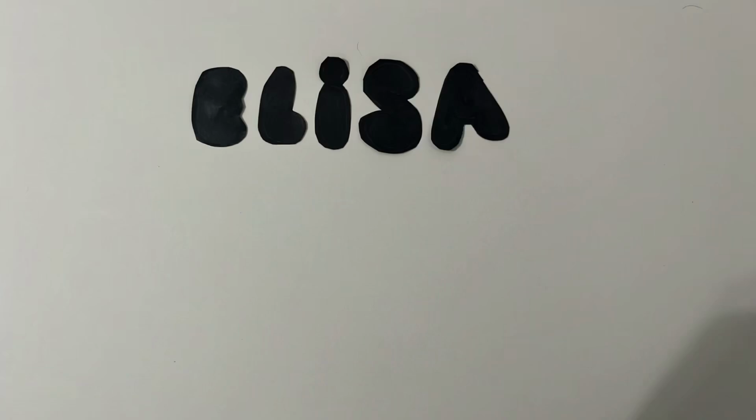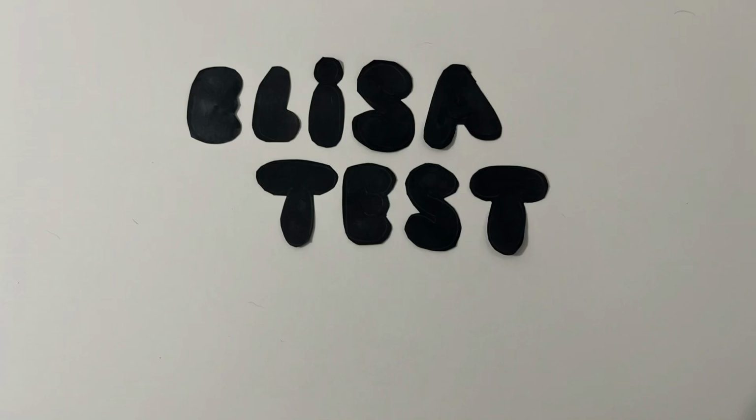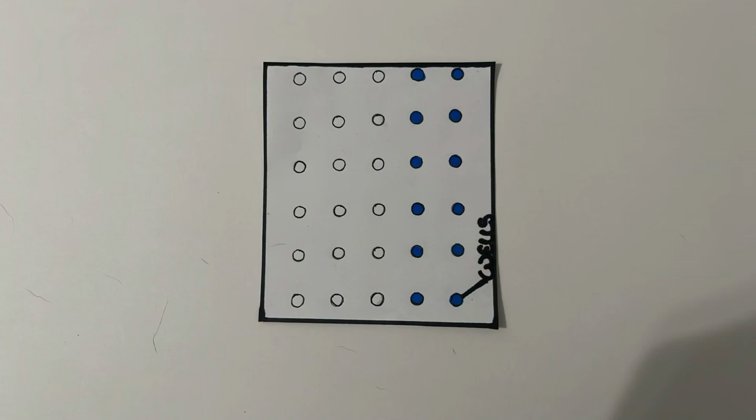Enzyme-linked immunosorbent assay is a test that uses people's antibodies to detect a targeted antigen using specific antibody-antigen interaction. ELISA testing detects quantitative and qualitative results. For example, it can detect the amount of a disease, or it can detect if a person is evaluated positive or negative for a disease.